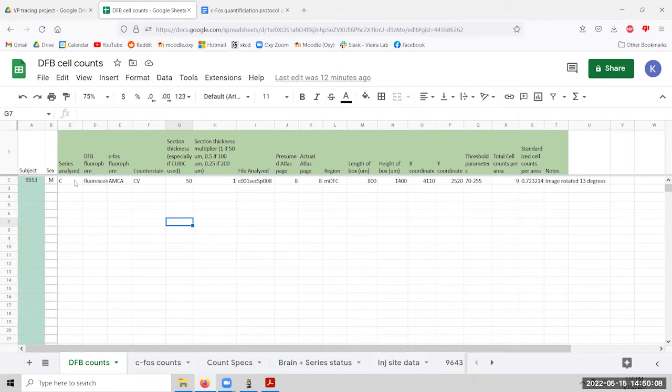When we have their brain sectioned, it is in various series. So we could basically pull more tissue from the same subject that goes across the whole brain, just representative snapshots. So we stain a whole series at a time, but that leaves multiple series of brain tissue still from the same brain. So for instance, this one we labeled series C, one that we just started staining for a subject we call series A or something.